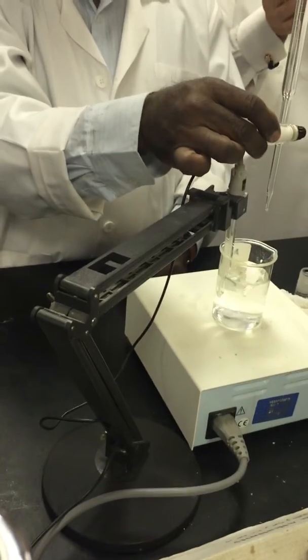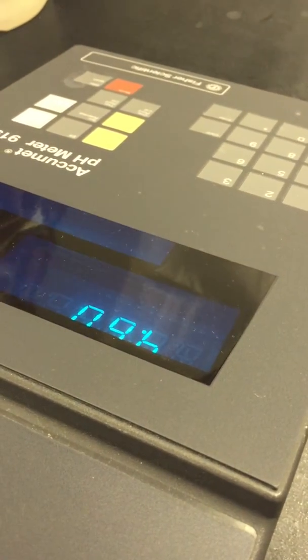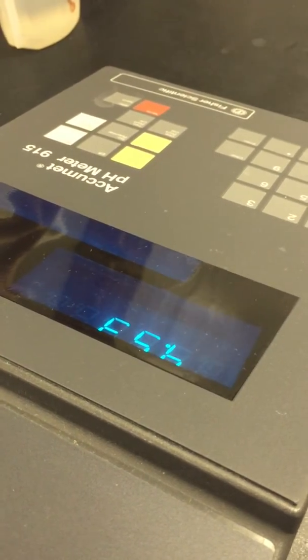Don't add fast. 4.8, 4.7, 4.6. Maybe 1 or 2 drops, okay. If it is 4.55 or 4.5, no problem. Now, very important for you, 1 drop or no drop.